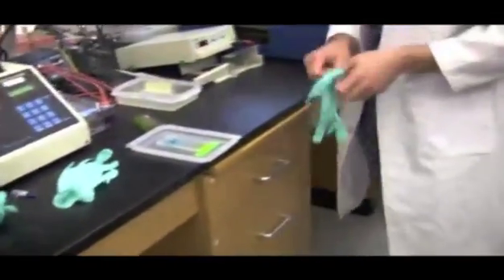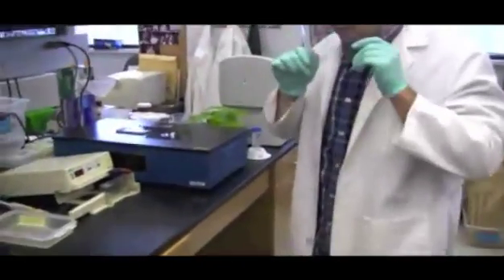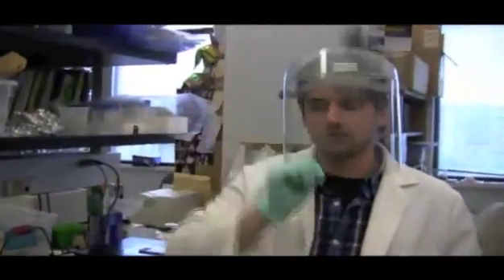Okay, so now I want to cut out just that little piece of DNA. And so again, because we put a molecule in here that will bind to DNA and then glows when it's exposed to UV light, we could use UV light to see those different bands and know which one to cut out. And I don't think we're going to be able to see it very well in here, but I'm going to put this on what we call a UV box, which is right here. And I'm going to turn it on. Got to put this guy on because UV light is bad. Wear sunscreen.